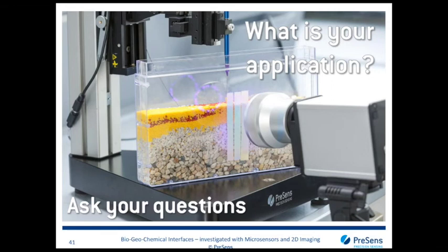Okay, and the next question is on how deep into the sediment core can I measure with the imaging sensor foils? Actually, our sensors are diffusion limited. That means that you measure the interface of the sensor foil. So what you actually do is you measure in direct contact with the sensor foil, or the part which is in contact with your sample, but not into deeper parts. If you want to go into deeper parts or the bulk phase of the sediments, I would recommend to use the microsensors.